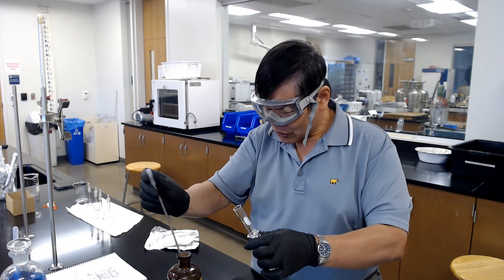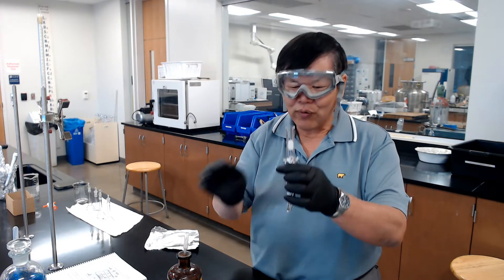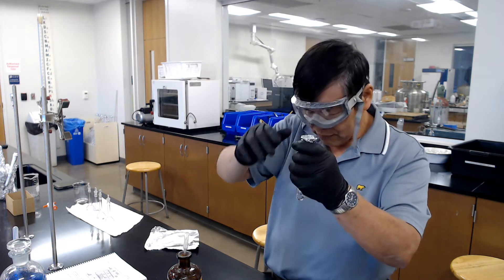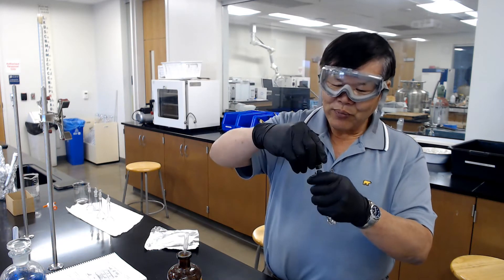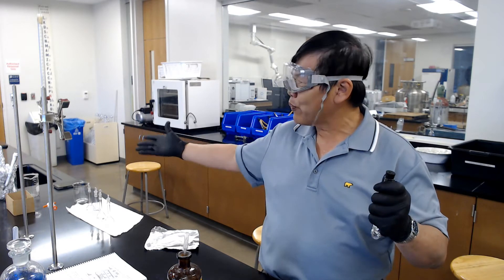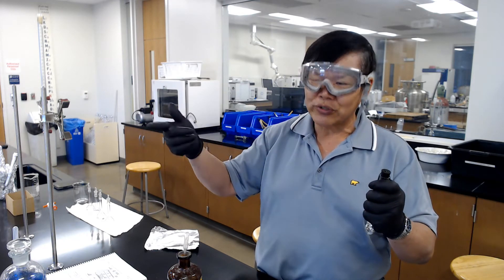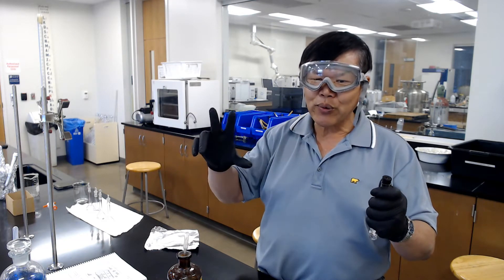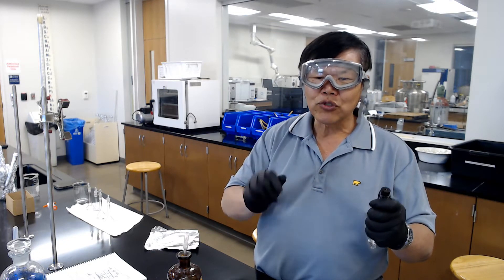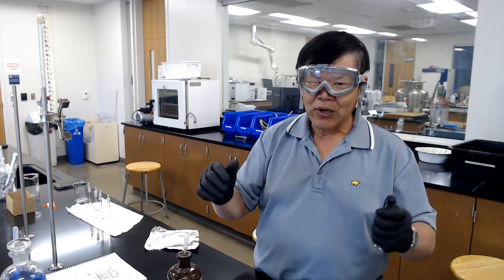Squirt the solution in until it fills to the top of the coil. Then shove the coil back in and put the stopper on. Once you've done all three, park them in a beaker and wait for a week so that the copper can reduce the silver. Next week when you come in, you'll have a blue solution — the darker the blue, the more copper there is, indicating more silver was originally present.